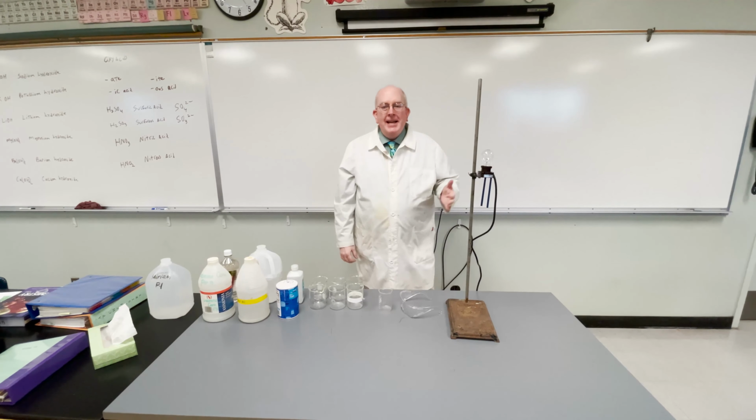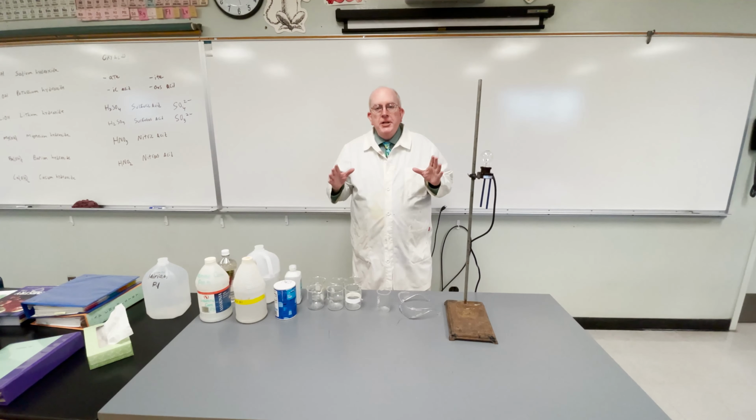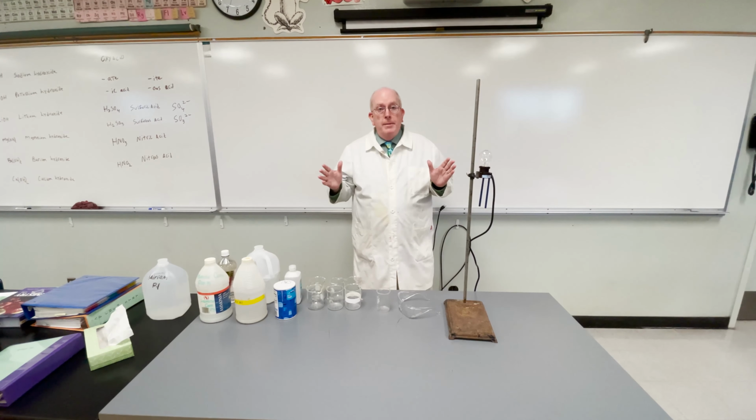So, Mr. Navarrete and I are here today. We want to show you the demonstration that I referenced on the first page of the lecture outline for acids and bases. It's called the light bulb demo.